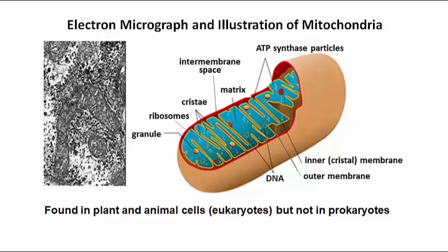Like nuclei, mitochondria are surrounded by two membranes, an inner one and an outer one. It is, of course, not perforated. There are no mitochondrial membrane pores. The cartoon emphasizes the double membrane and the familiar elaboration of the inner membrane into cristae, which can also be seen in the transmission electron micrograph.